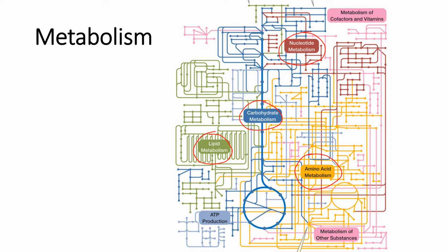So a biochemical profile is getting a list of the enzymes or the reactions that the bacteria is capable of performing. And to do this, we can't see the actual molecules or reactions taking place, so we use indicators.